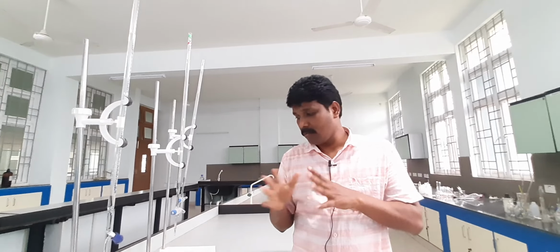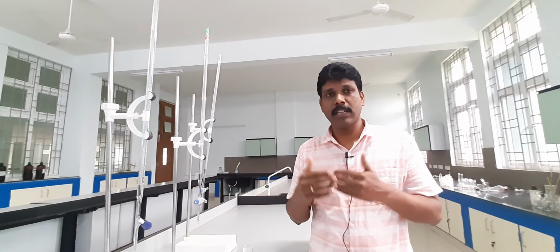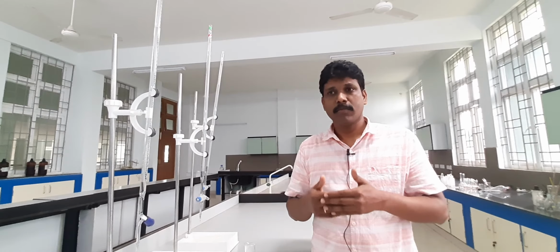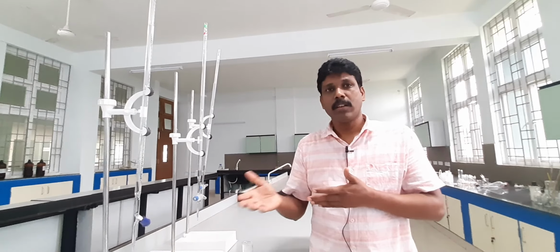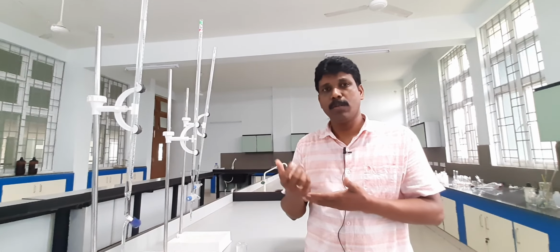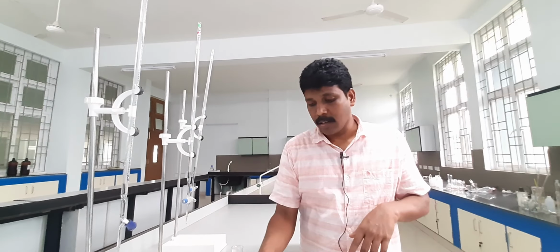So this is the small demonstration about the phase diagram experiment, how to construct a phase diagram for a 3-component system. For this we need 3 liquids, and we have to take different compositions of any 2 liquids. For the sake of convenience, I have taken chloroform and acetic acid, and for the third component, how much is required for a specific composition of the liquids, you have to estimate. That is the data collection part. Then the rest is the calculation part, which I will be discussing. Thank you for listening.